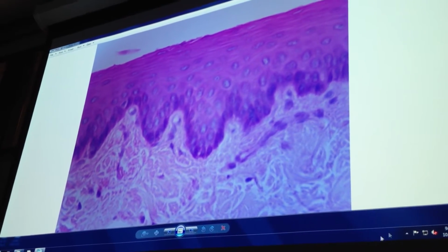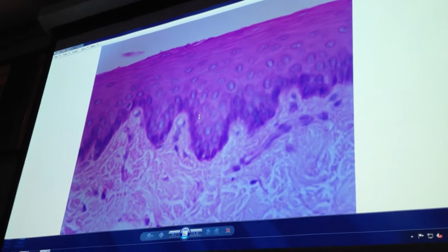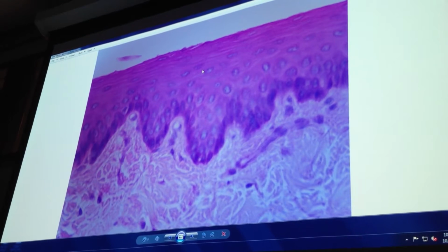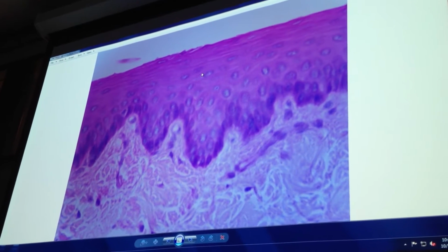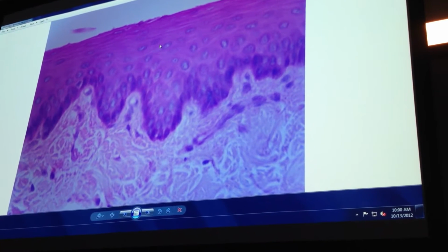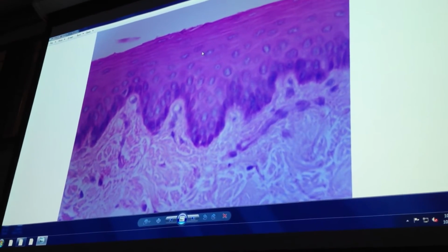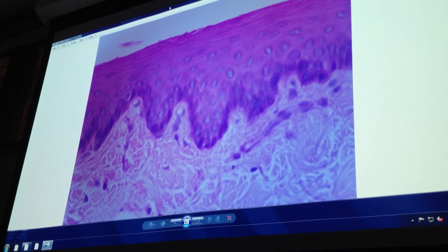Okay. What's this? Basement membrane. Okay. Three words that name that epithelium: non-keratinized, stratified, squamous. Give me an example of an organ where you find that.